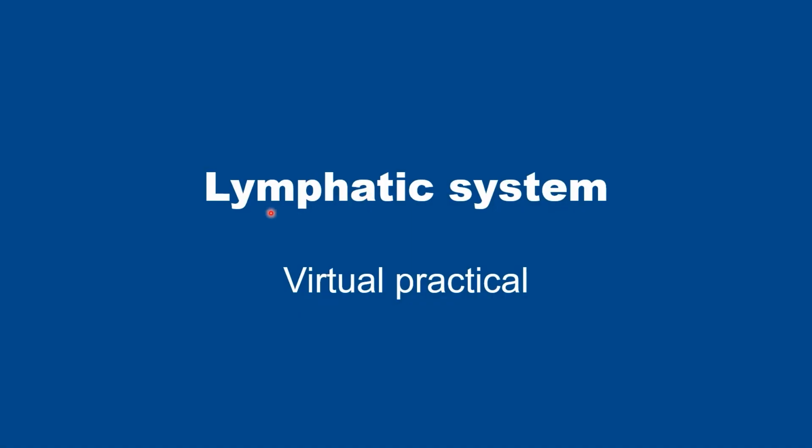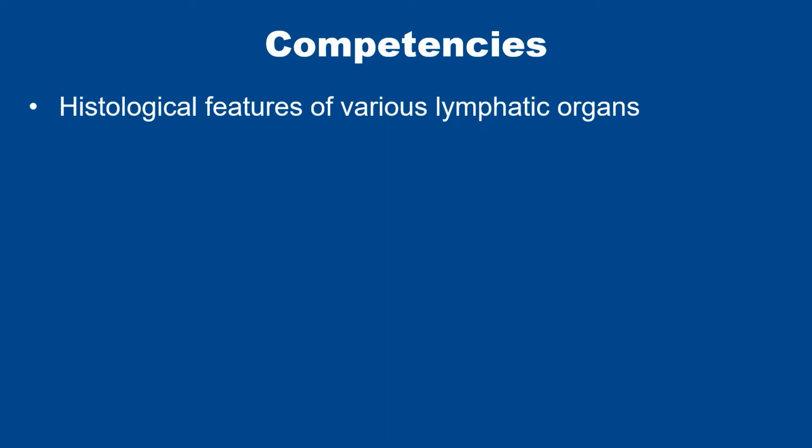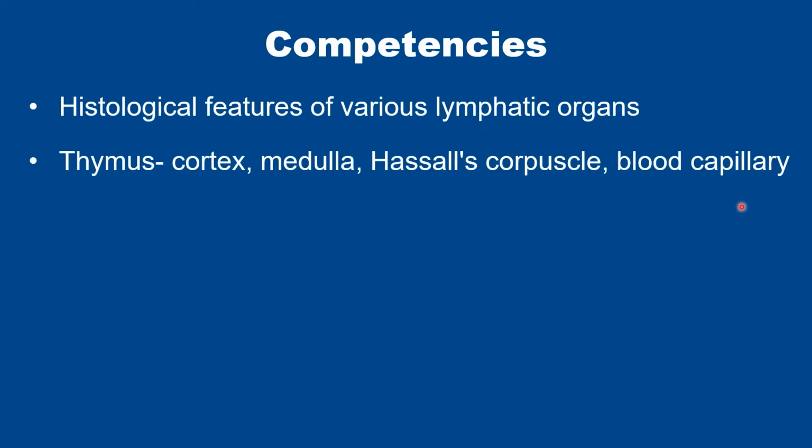Welcome to the virtual practical class on lymphatic system. In this class, we will identify the histological features of various lymphatic organs. For thymus, we will identify the cortex, medulla, Hassall's corpuscle, and blood capillaries.